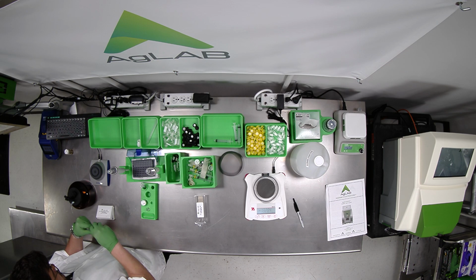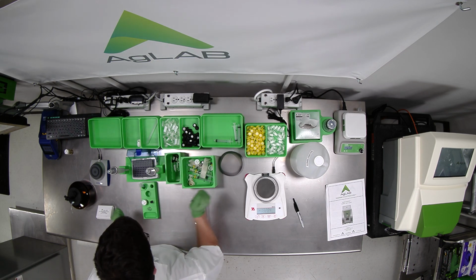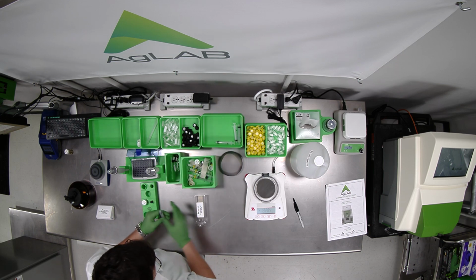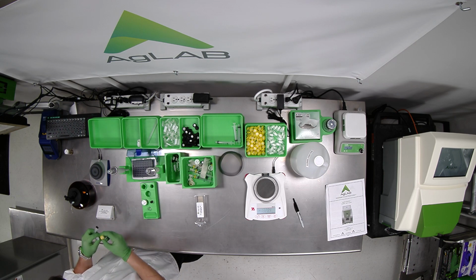Okay, we're ready for the final transfer into our last vial. We already have a syringe. So again, tail samples, nylon filter only.